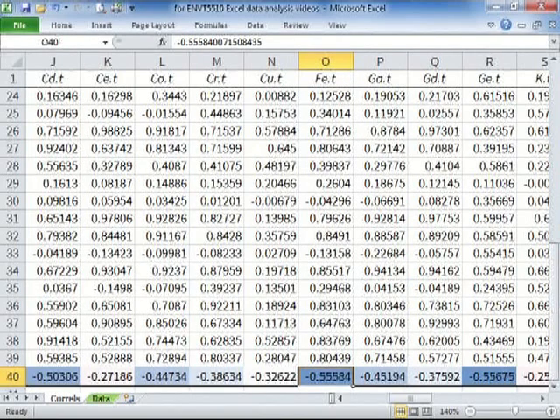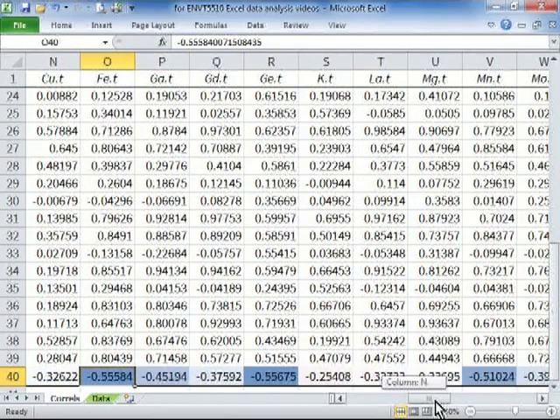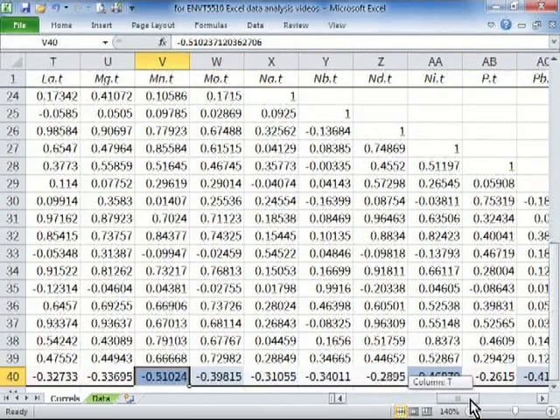So the more iron in soils, the less proportionally we can extract with DTPA, which kind of makes sense if iron is retaining zinc in a form that DTPA can't access, which is quite likely. So that's why I'd go through it. Manganese is doing something similar, and sometimes manganese oxides perform a similar role to iron oxides. That may or may not be the case here.